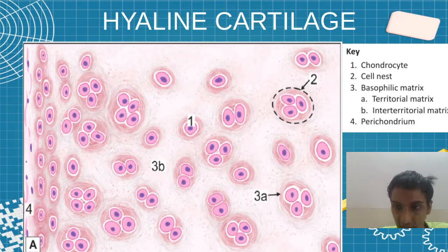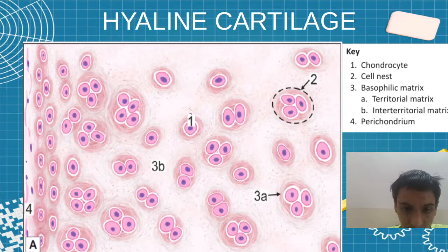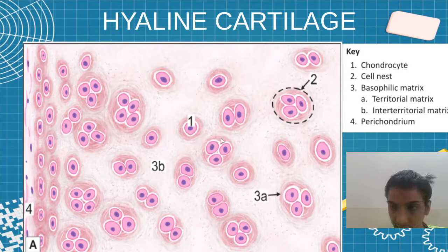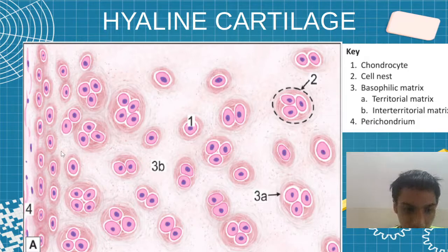First, hyaline cartilage. Here we are observing a number of chondrocytes, which you can see in pink color. You can also find the nuclei, the chondrocytic nuclei.